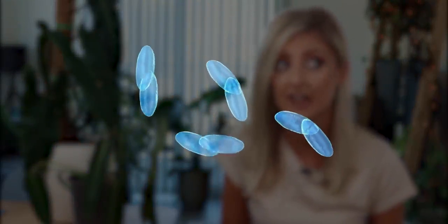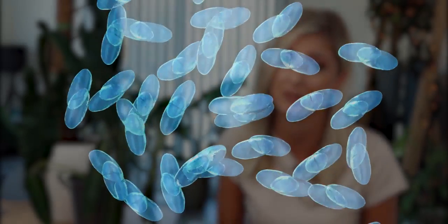A very quick note on sterility and just generally having sterile conditions. The environment that we use for tissue culture and the conditions that these plants are grown in is absolutely ideal for any fungus and basically mold. And the problem is mold and fungus will actually multiply quicker than any plant material in this environment can grow. So if we get any contamination in there, it's pretty much game over, because it's going to multiply quicker than the plant can multiply, thus killing the plant material. So it is so important to keep things really, really sterile.